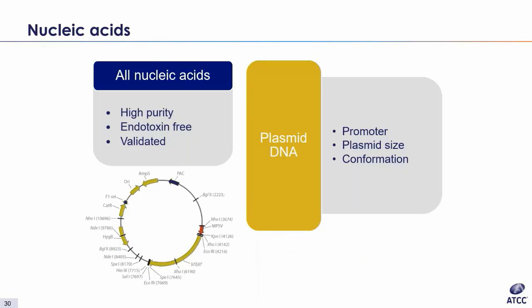So a little bit more on transfection best practices. For nucleic acids, which are DNA or RNA, one should use high-purity and endotoxin-free material to achieve the highest transfection efficiency possible. Endotoxin appears to lower transfection efficiency. For DNA, one should verify promoter strength for the given cell being transfected. Certain promoters are known to work better with certain cell types. Plasmid size is also a concern. The larger the plasmid, the lower the expected transfection efficiency. You should also verify that you are using a complete sequence in your plasmid. DNA plasmids that have been stored for some time can become degraded or nicked.